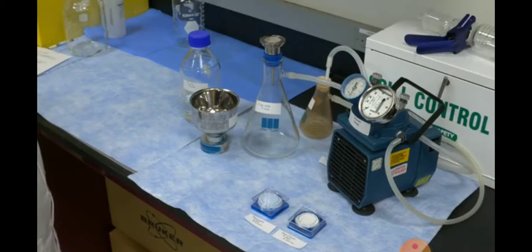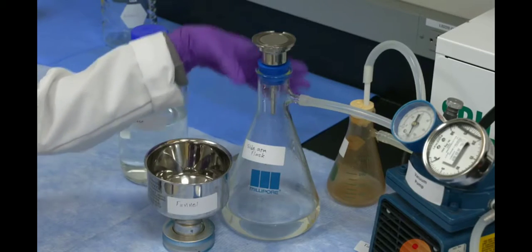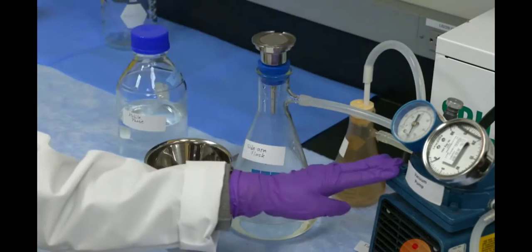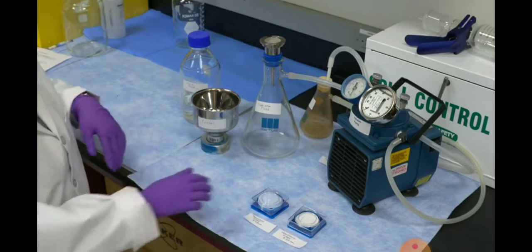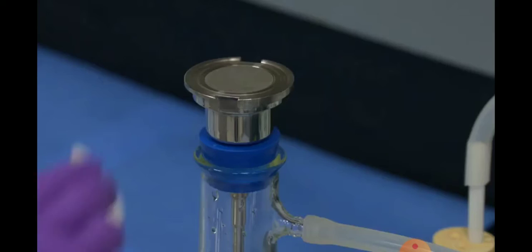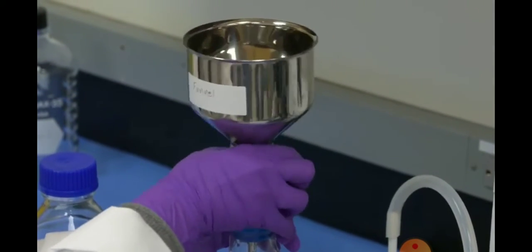To start the filtration process, for the setup, you will need mobile phase, funnel, sidearm, trap, tubing, vacuum pump, and membrane filters. You can either use 0.45 µm or 0.22 µm. To initiate this process, you will select the membrane filter, insert it on the membrane filter holder, then tightly secure the funnel on top of it.